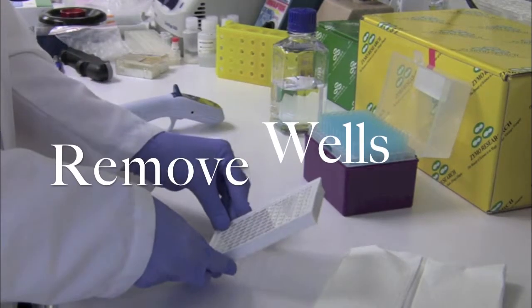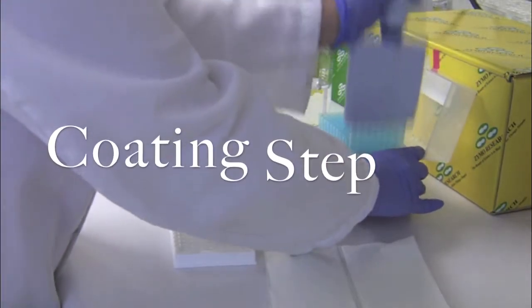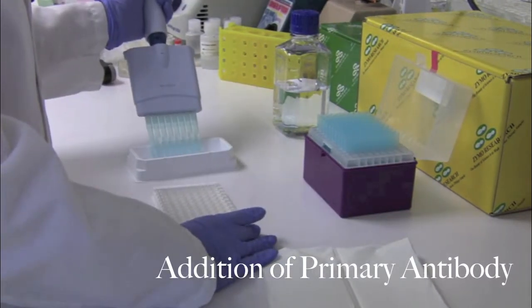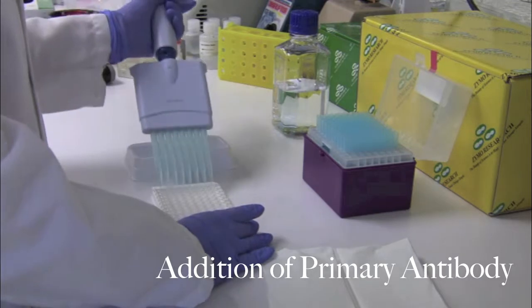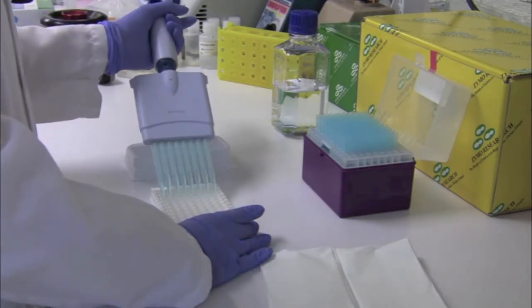Another added benefit is that the workflow is so simple. To begin, simply remove the strips of wells that will not be used for the experiment. Next, anti-5-HMC polyclonal antibody is coated to the bottom of the 96-well plate. The plate is then incubated at 37 degrees Celsius for one hour.